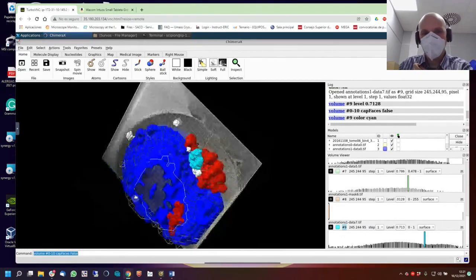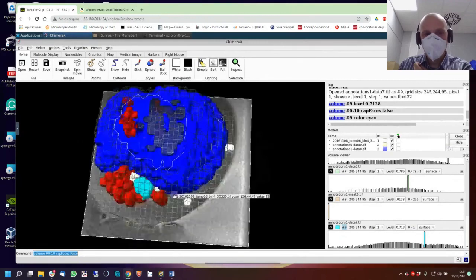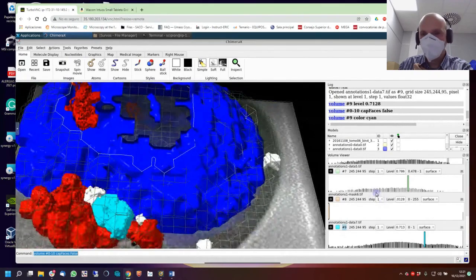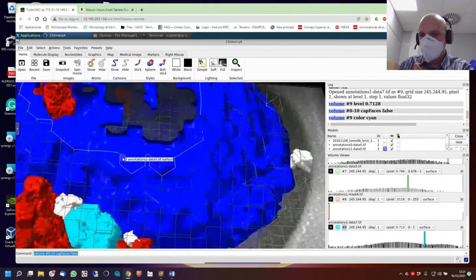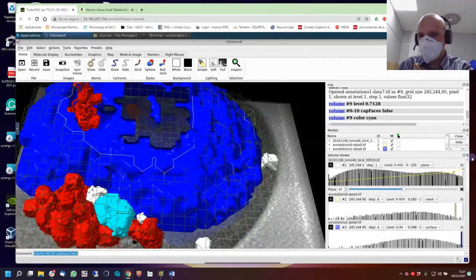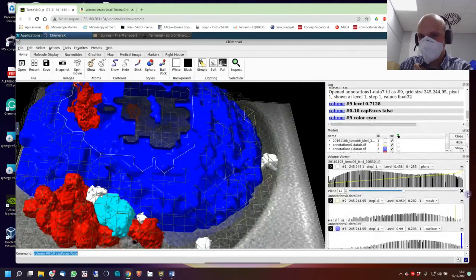And we can show the cell in 3D and play with this. With the mouse wheel, go up and down. Now it's just a matter of playing with how we want to show it. We can go with this. Here, I think there's a possibility to rename it to the name you want. Sometimes in the mesh I don't want to see the mesh, so here you unvisualize stuff.